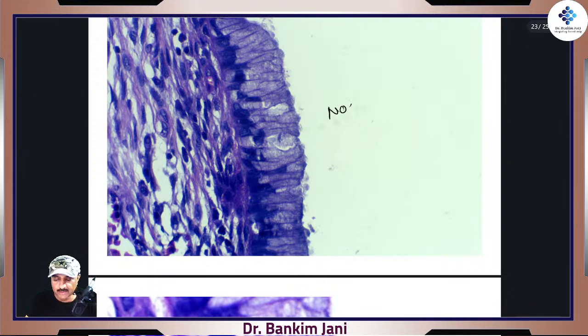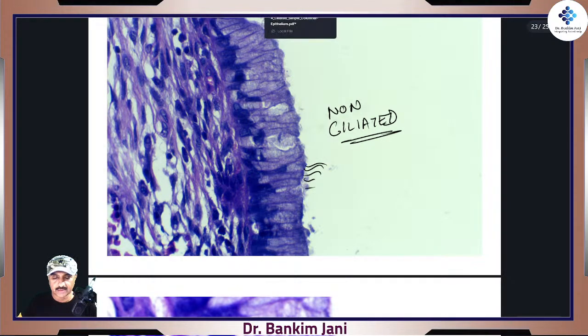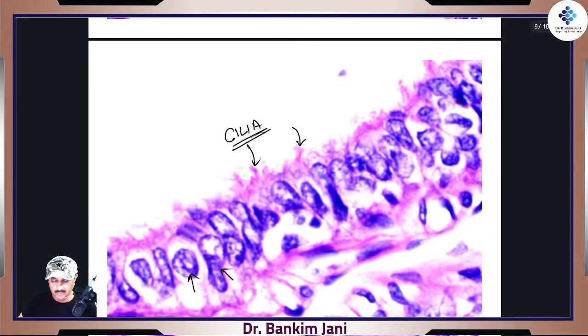This is non-ciliated, and when it is ciliated, it would be literally like this. See the next image. Now there should not be any doubt.